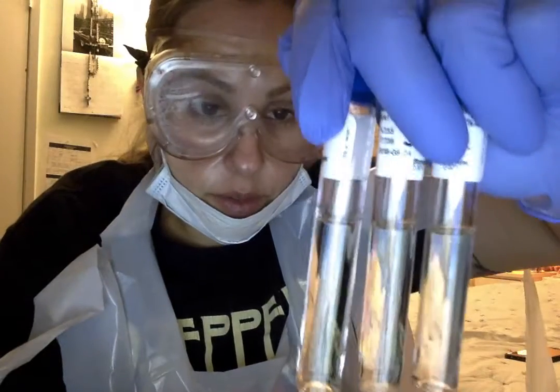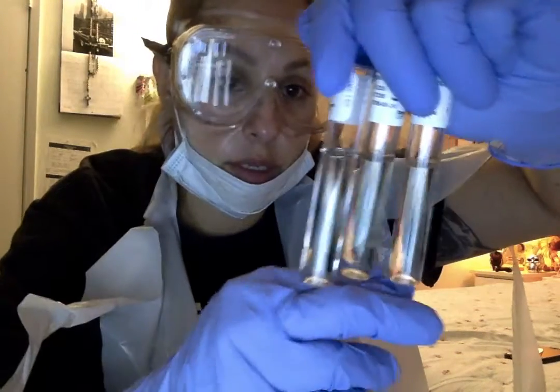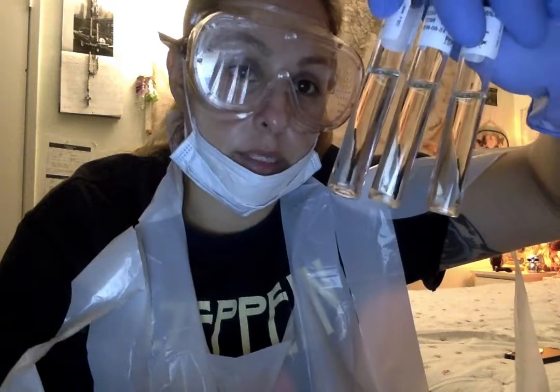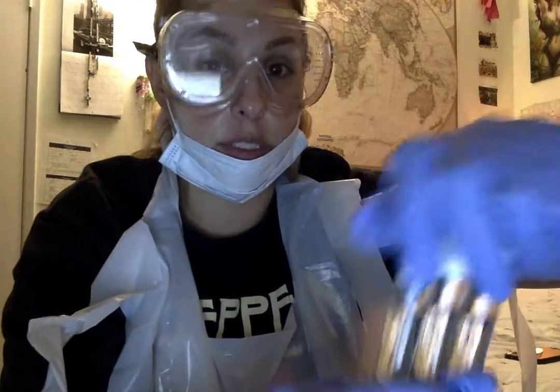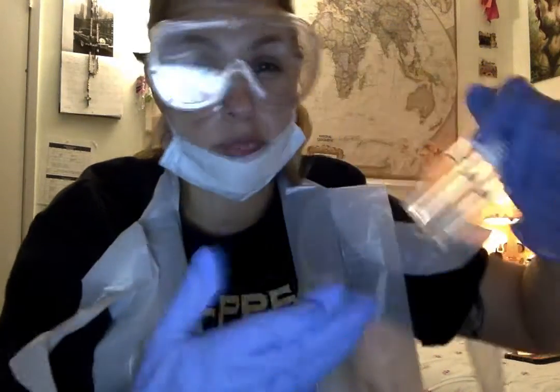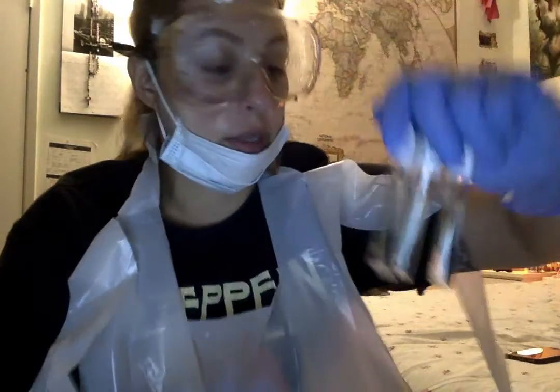On these ones, let's see, I'm just going to hold them up here. As you can tell, they're all pretty clear. So these all tested, as far as I can see, negative. I did actually let all of my cultures incubate for 48 hours. I tried 24 hours and I didn't see much change, so I tried 48, but still not much change as far as these go.